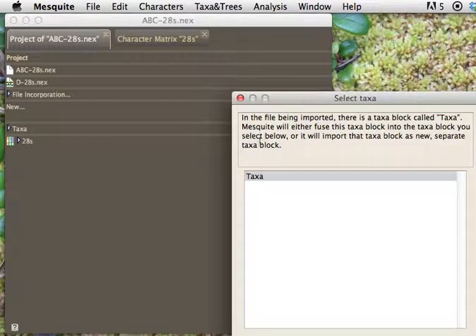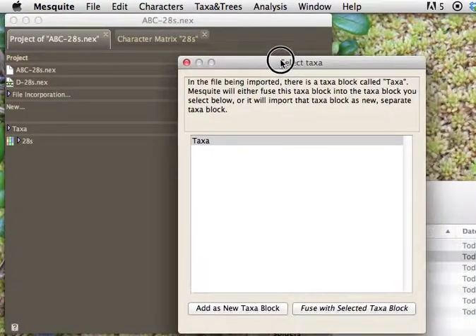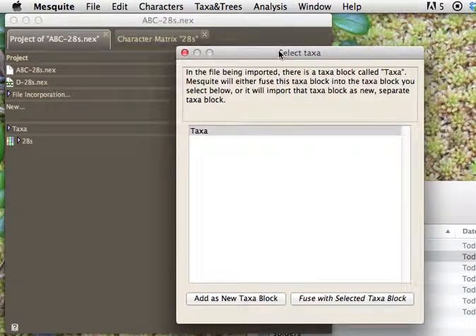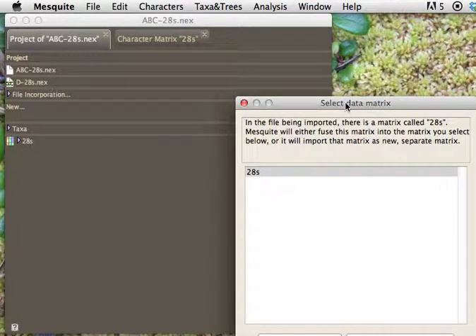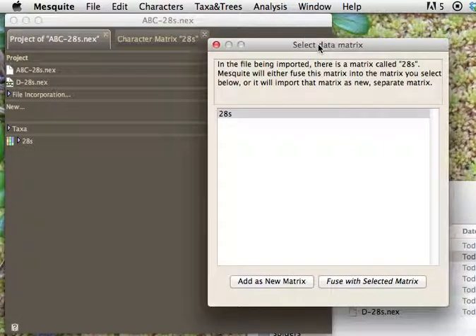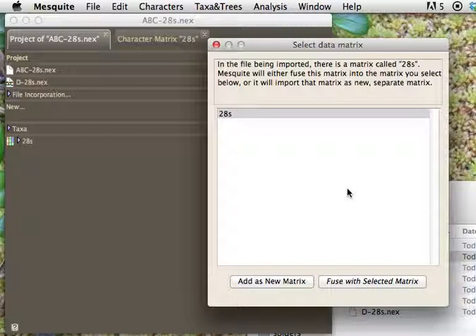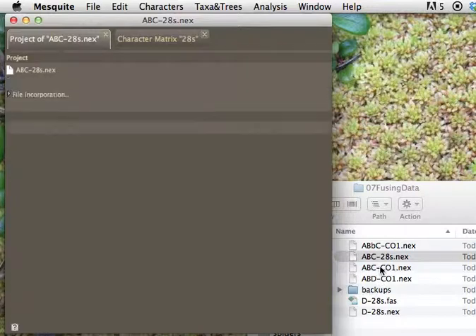It has to be a nexus file, and then it says, hey, I've just found a block of taxa, in that case containing just D. What am I supposed to do? We're going to fuse it with the selected block of taxa. We don't want a new block of taxa. We want to fuse it. And it says, there's a file being coming in. There's a matrix called 28S. What do you want to do with it? And in this case, we're going to fuse it with the existing one.